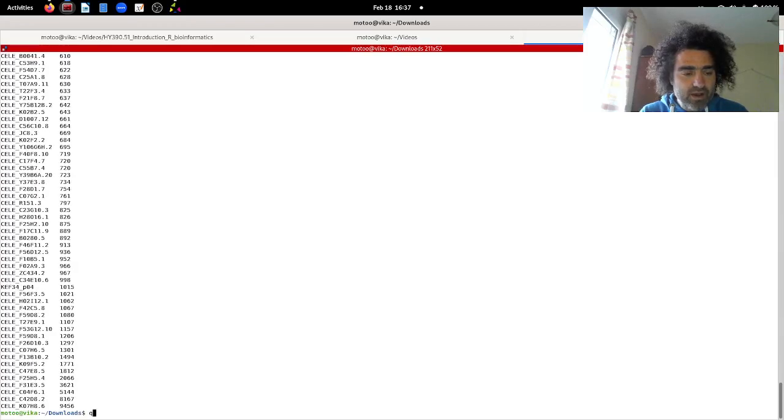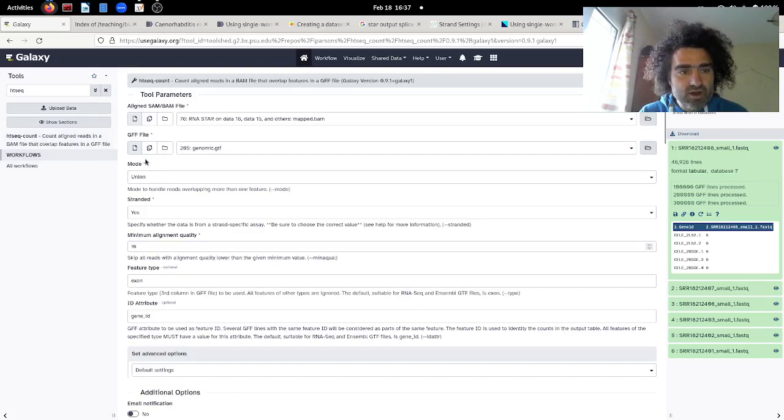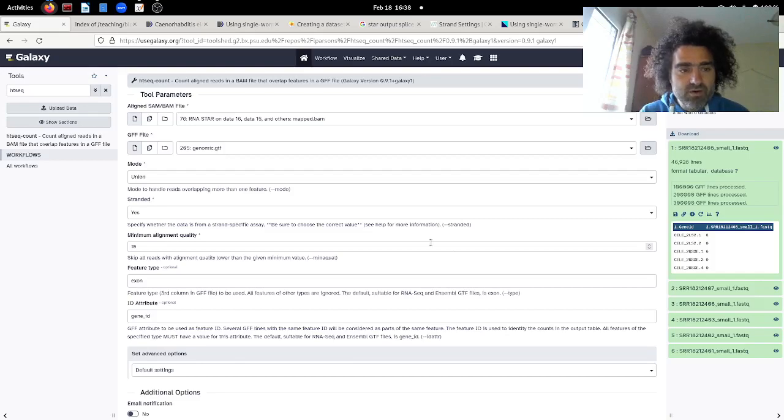Okay, so now I have my results done. It was a bit tricky with HTSeq. I just remind you what you have to do. First of all, when you use HTSeq, the usual thing is to check the mode union, so to allow for partial overlap between a read and a feature. Then for the stranded, which is the tricky part, you should know if the library is stranded or unstranded. If it is stranded, then you should know the direction. And then you should use a proper GTF or GFF file. So the GFF that we had was not proper because it didn't contain consistent information for each exon. Sometimes transcript ID, sometimes something else, sometimes nothing. So I chose the GTF file, which contained all the time the gene ID information, and the results were good.